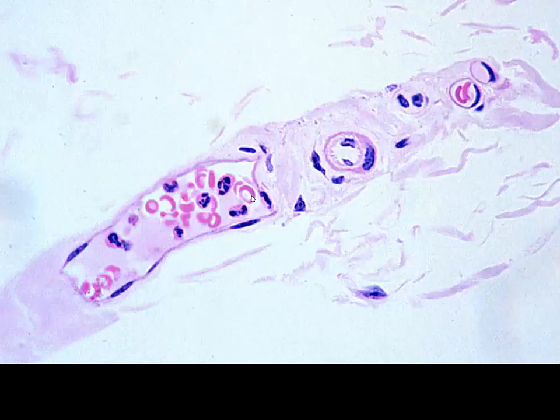These are pretty cool images that we see here. We're seeing somewhat of a tangential cut through a blood vessel. We can see our red blood cells, but we see a lot of white blood cells, and they are actually neutrophils, polymorphonuclear leukocytes. We've got our endothelium here, possibly a pericyte, but again, when you look at that luminal diameter, we're probably looking at a venule.